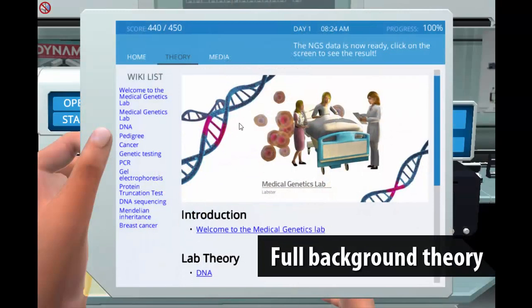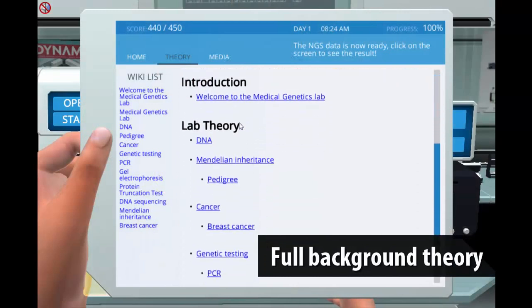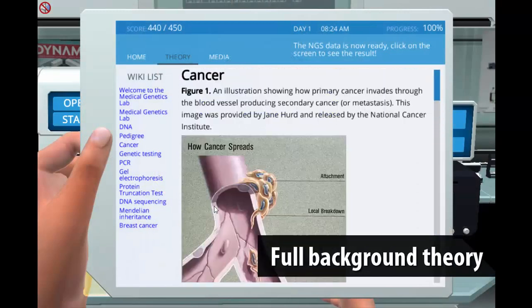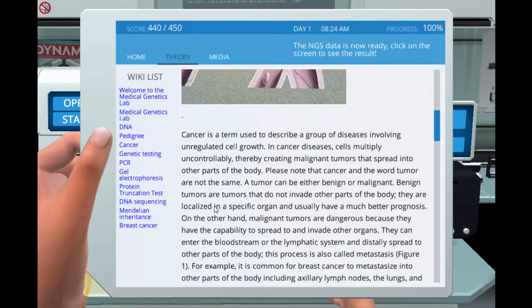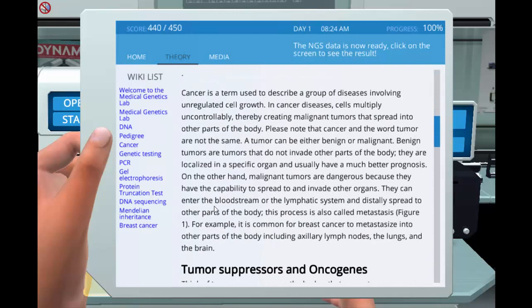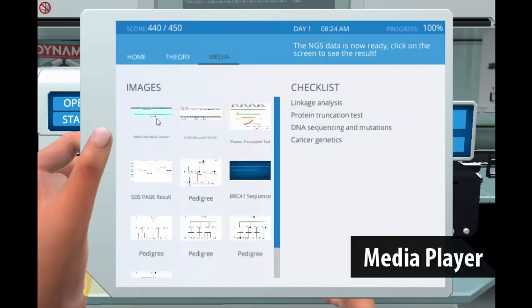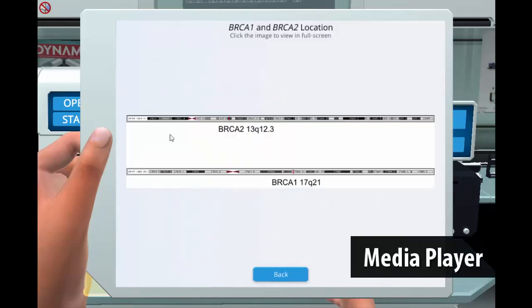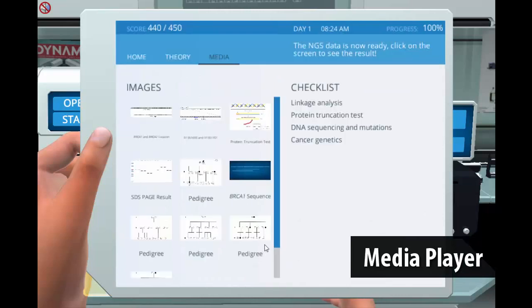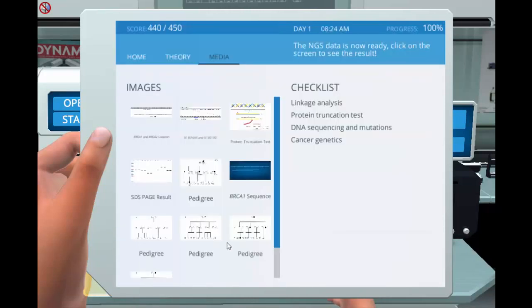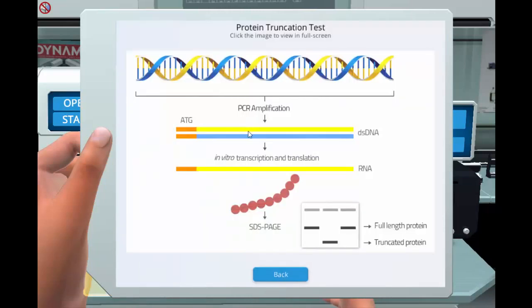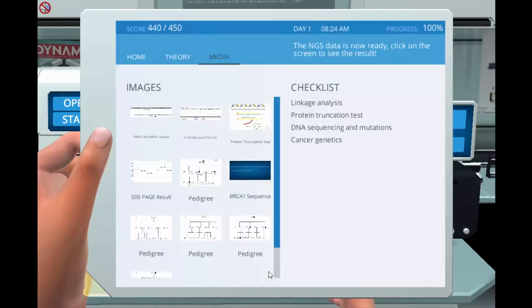Besides the core lab, Labster provides a full theory section which provides the student with relevant background information when needed. Also with the media player function, students will be able to see the animations, graphs and collected data several times during the lab as well as at a later time for exam preparation.